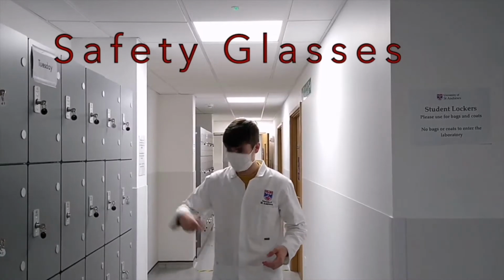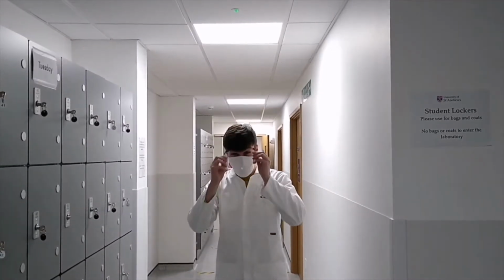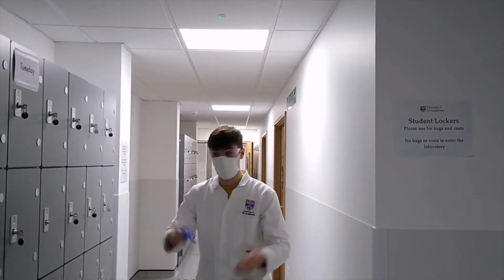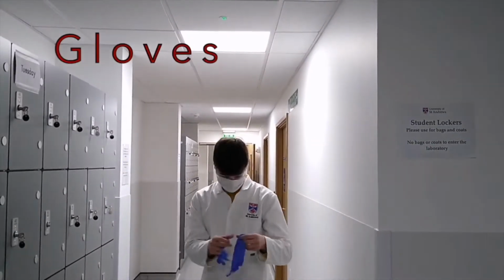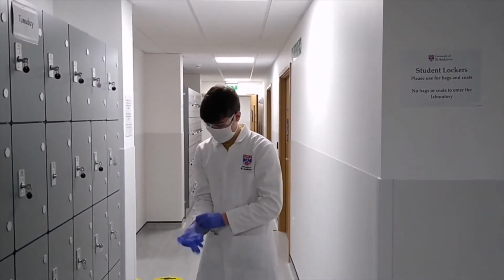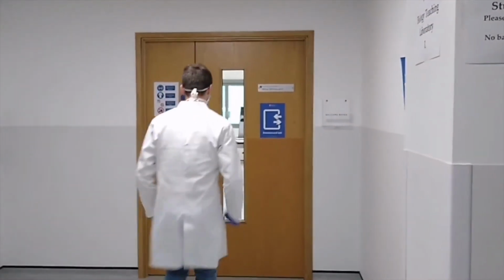Now what about his eyes? Not to worry, he's got them covered with a pair of goggles. Just one more piece of clothing before we can step into the lab to run our tests. We hope they're not too small. Now Adam can enter the lab to start his tests.